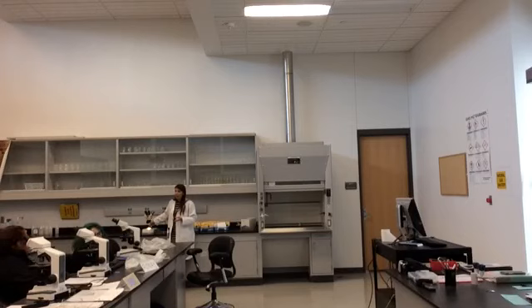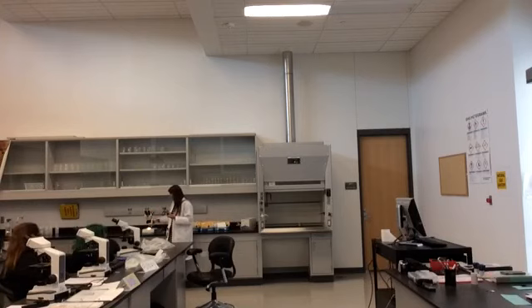This is not intestine here. Right here, this is a mouse skull, and you'll have it for your lab to look at. And when you look at it underneath there, it magnifies it. You can see stuff on it that you wouldn't see with your naked eye. So these still magnify 10 times, the oculars do, but you can see here that it's magnified 4 times when it's on that setting, and when you roll it over here, it's magnified 2 times. So 2 times 10 would be 20, 4 times 10 would be 40.